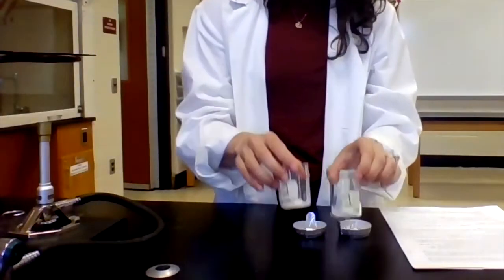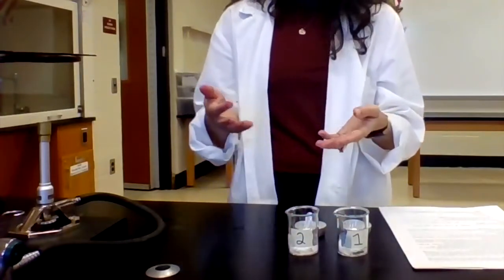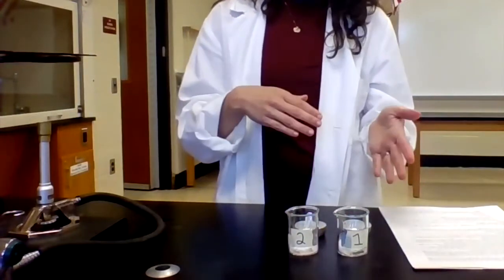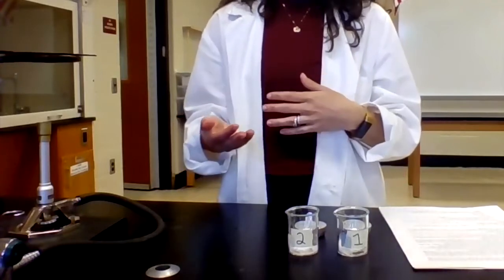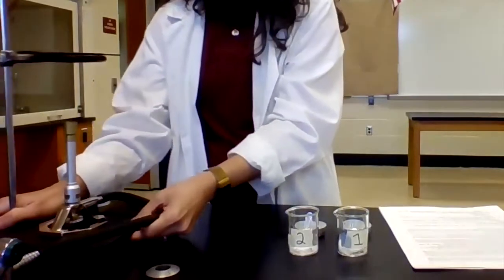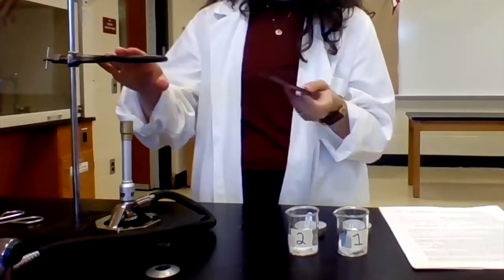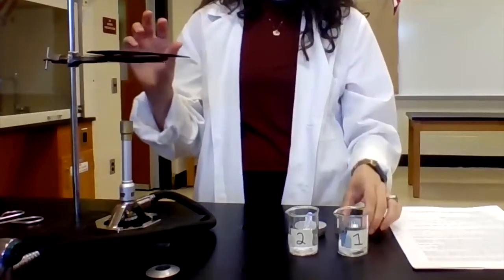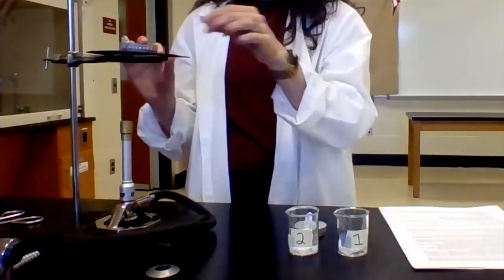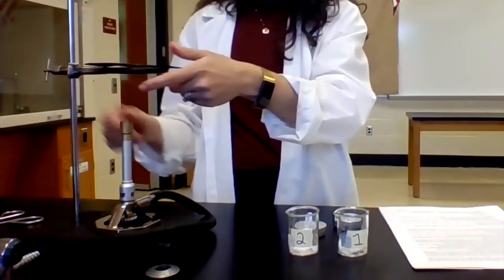But solid 1 and solid 2, I do want to see if I'm able to melt them. And so to see if they have a moderate melting point as opposed to a high melting point, this is where I'm going to use the Bunsen burner. Okay, so what I have here is my iron ring, and the wire gauze is so I can rest my solid over top here, with my Bunsen burner underneath.